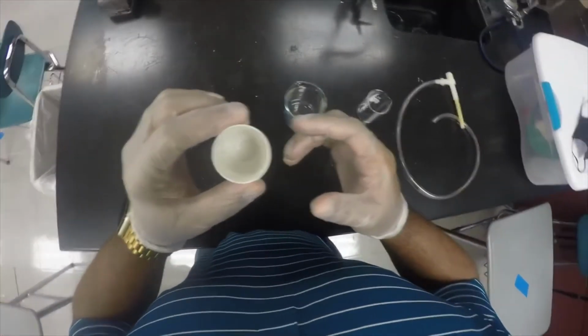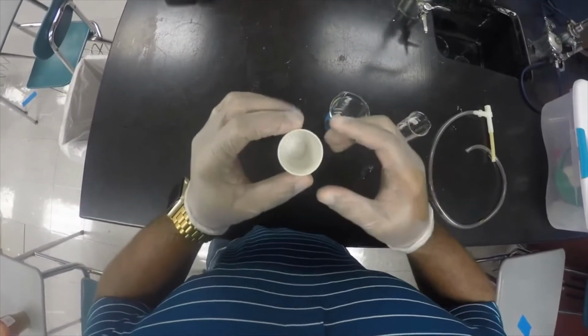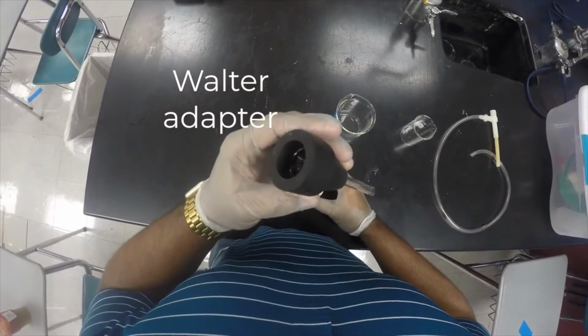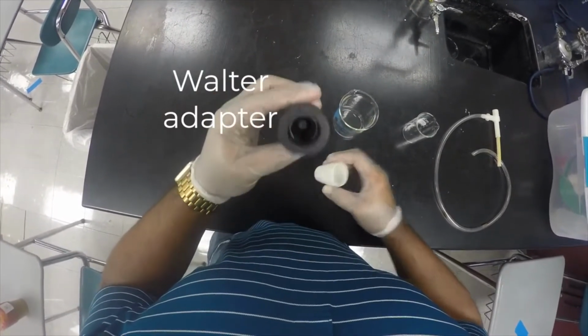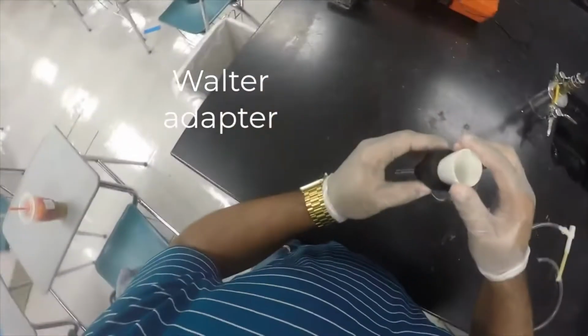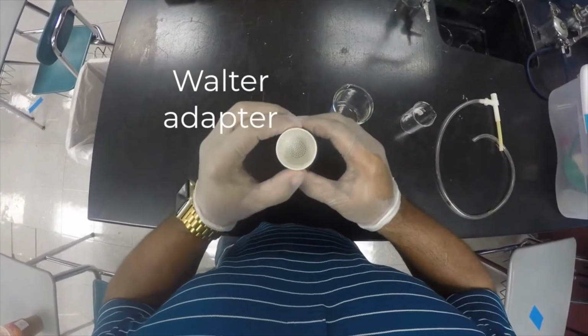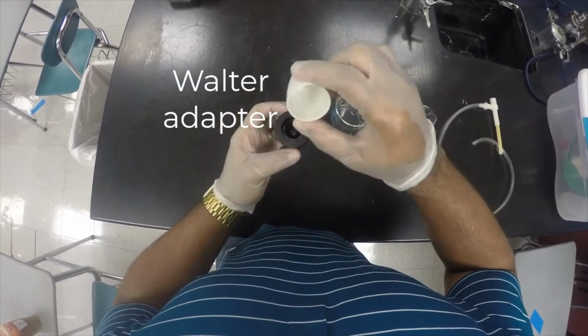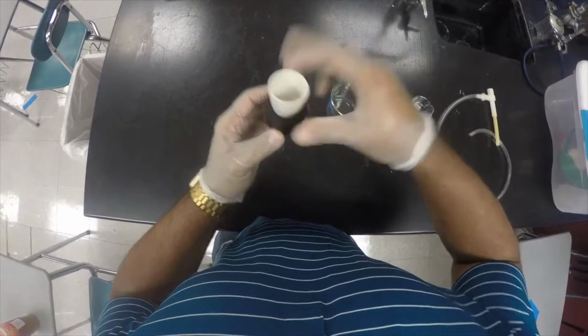We use a piece of filter paper with this, which I'll show you in a few minutes. This is something called a Walter adapter. The Gooch crucible fits inside of the Walter adapter, so that when filtration is occurring, the Gooch crucible has a place to sit.